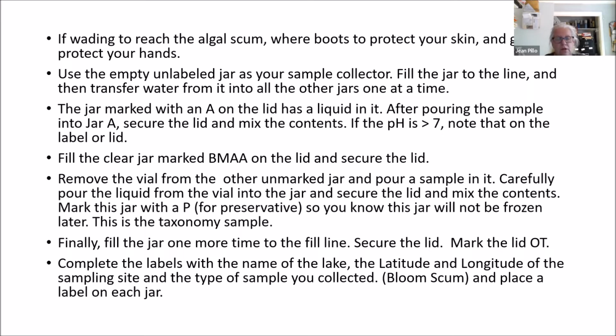So anyway, you're going to fill this jar. You're going to take the little vial out, open the jar, fill the jar, take that little vial, empty it in there, close this jar, and mix it. It should become kind of foamy, is what I was told. But this is the sample that they're going to do the taxonomy from. That's why it's not frozen.